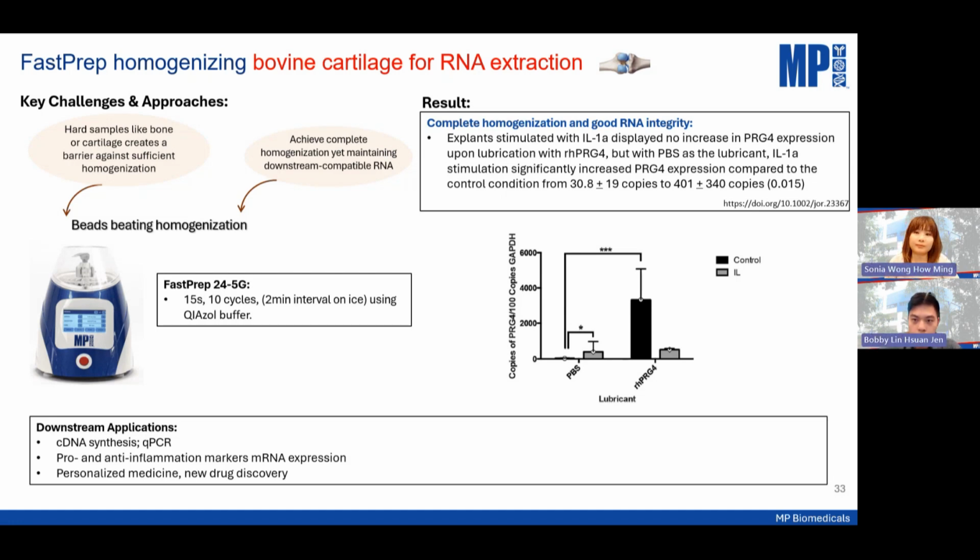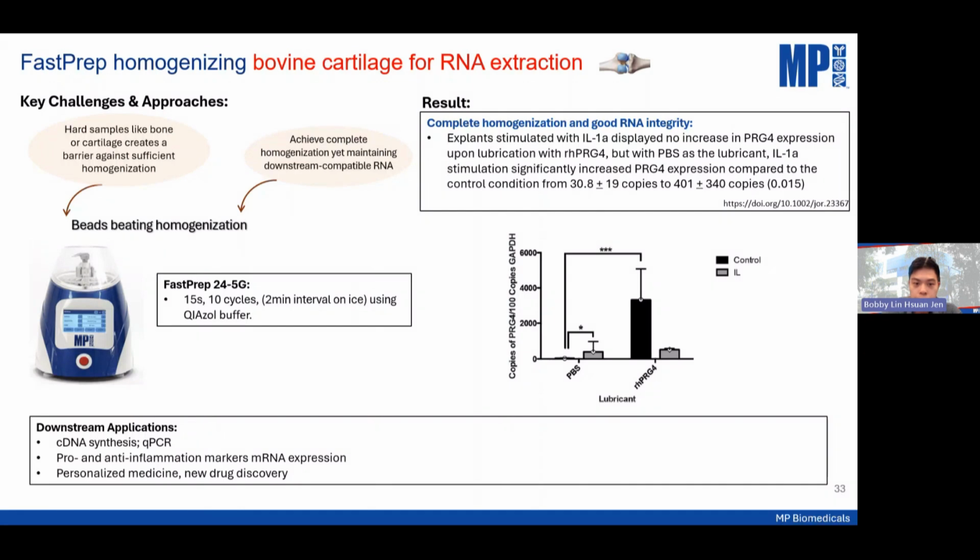Okay, so to add on to Dr. Sonia's case study, I think this gives us a good chance to talk about the further challenges that our customers are facing as well. With forensic samples, we usually tend to have difficulties like over-shearing and over-processing, which generates a lot of heat. So for heat, how do we actually address the concern for that, Dr. Sonia?